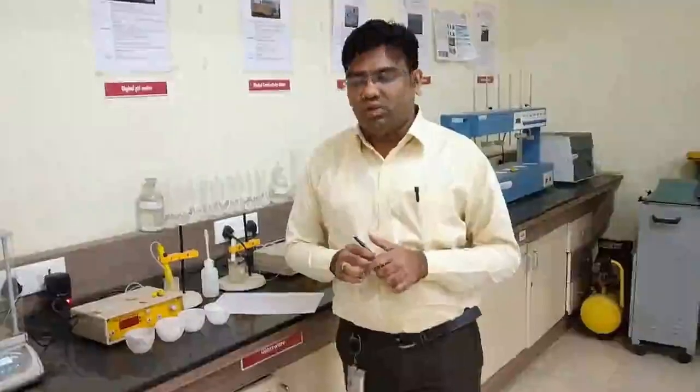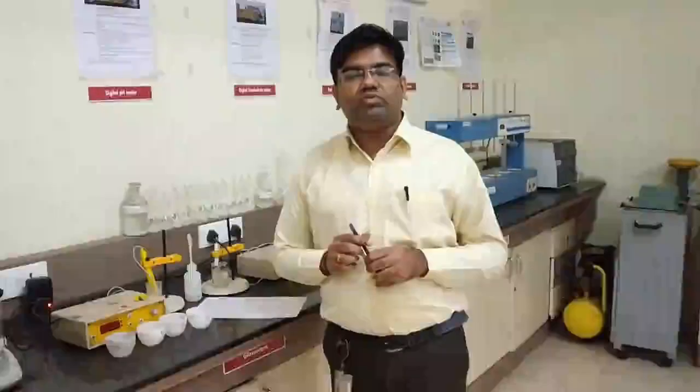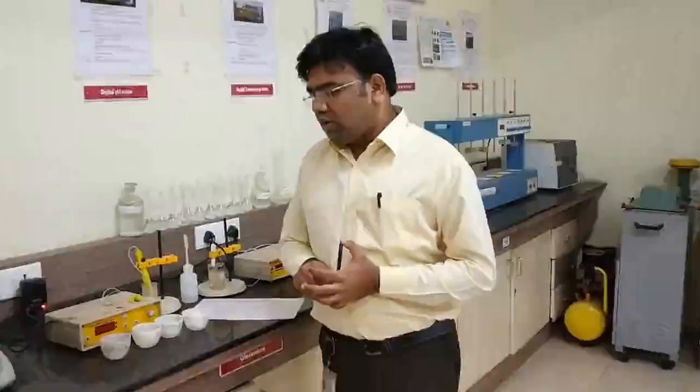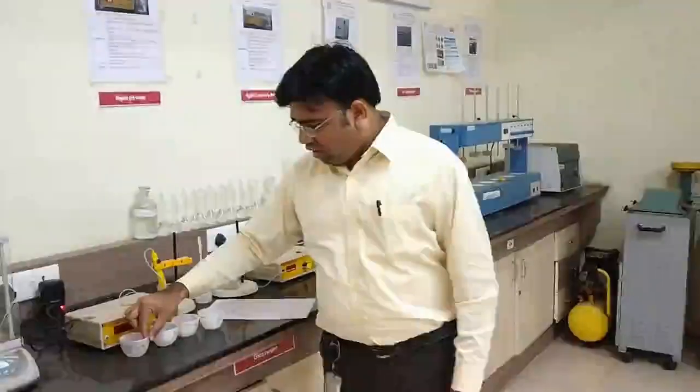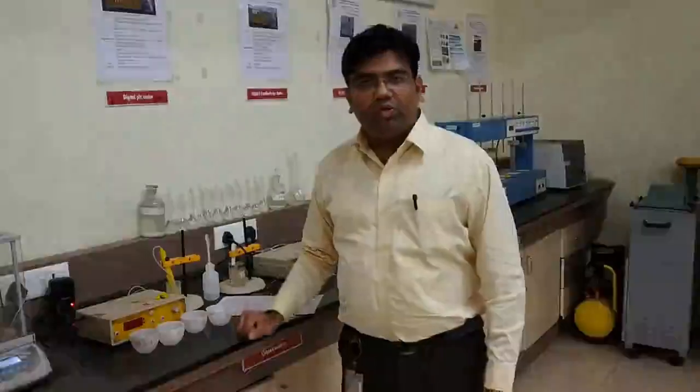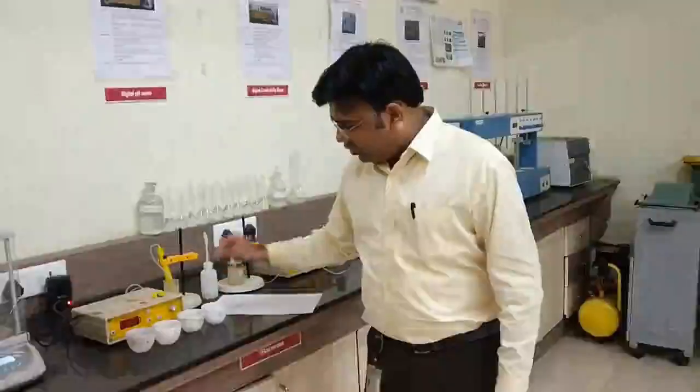We are going to see the determination of solids experimentation. As we have seen in the theory part, we require crucibles for the determination of the solids, and what we are going to do initially is take the empty weights of the crucibles, right? Crucibles A and B here will be used for the determination of the total solids, and crucibles C and D here will be used for the determination of the total dissolved solids.